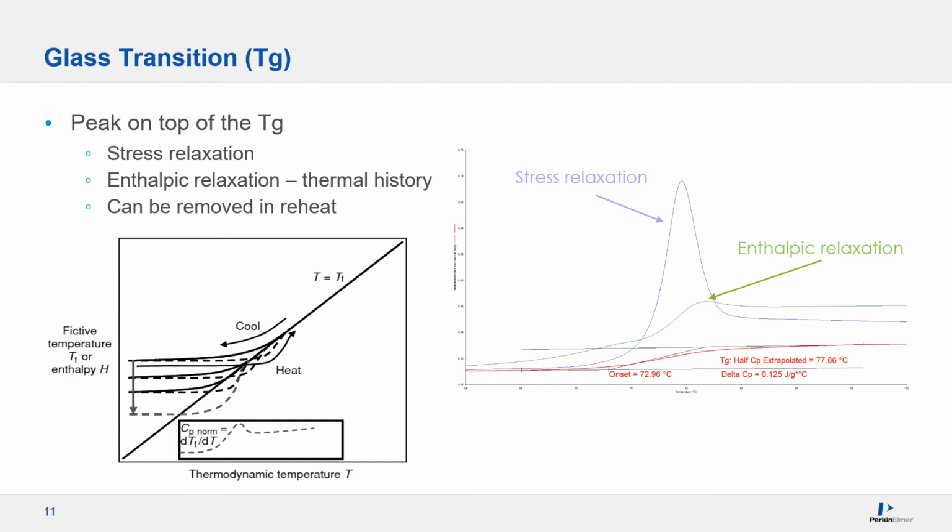The previous slow cooling or annealing relaxed the material into a lower enthalpic state, as you can see from the left graph. Starting from the upper right down the line to lower left, slow cooling allows the material to take an early exit to the left.